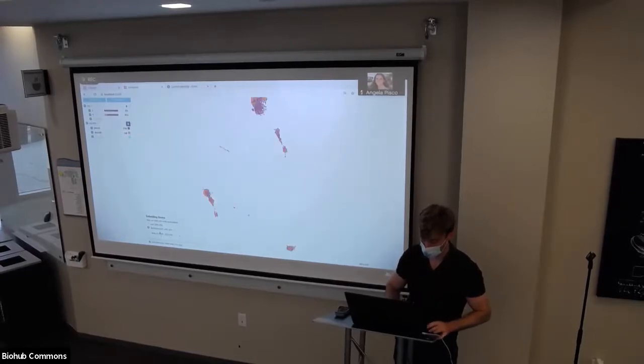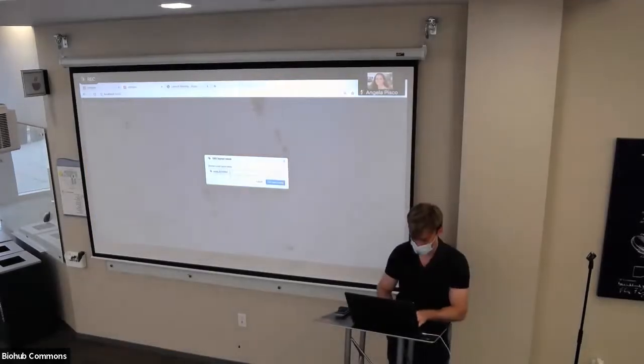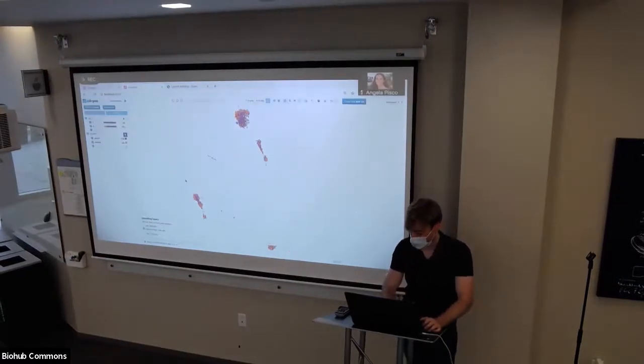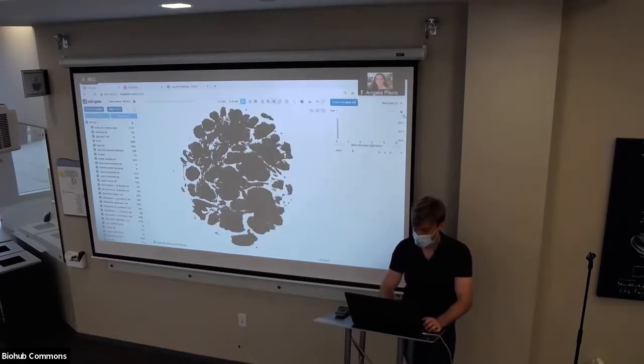So what this will do is delete both batch corrected and all of its children. It's a nice way of cleaning up, but I'm not going to delete it yet. You can also use these three dots next to the X to rename our hashed thing into, I don't know, pop1, and it just renames it. So this is really nice, because now what we can do is go here, and let's stop coloring by everything.